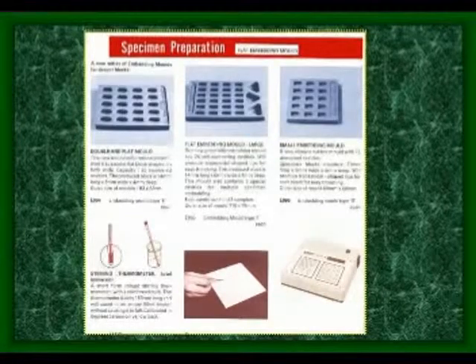Then again rinse in buffer. You have already added the osmic acid, so the excess osmic acid should be removed. For that reason we have to rinse in buffer three times, each at a 20 minute interval at 4 degrees centigrade. After repeatedly washing and rinsing in buffer solution, you can go for the next step, which is known as dehydration.